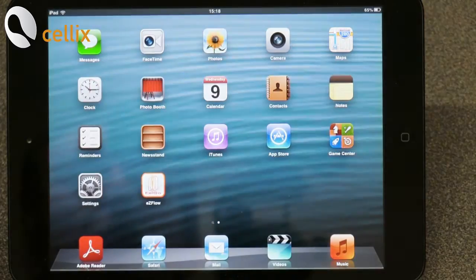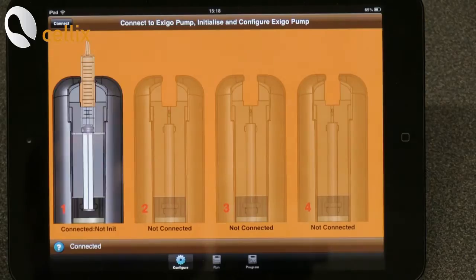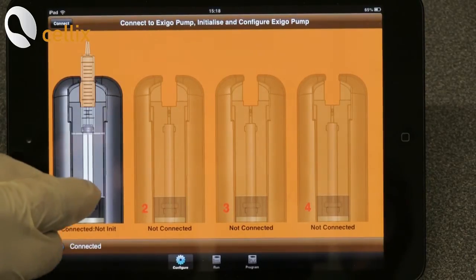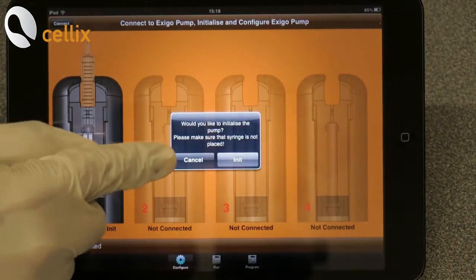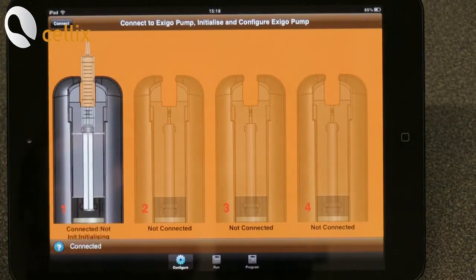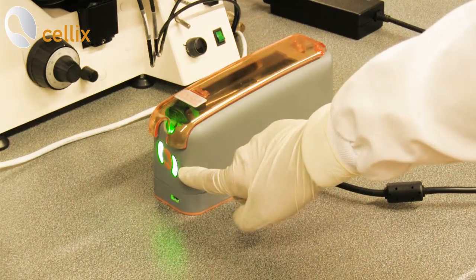Next, we need to start the app by clicking, then click Connect. You double click the plunger and it asks to initialize the pump. Click Initialize. Now the pump is initialized. You can see the green color.